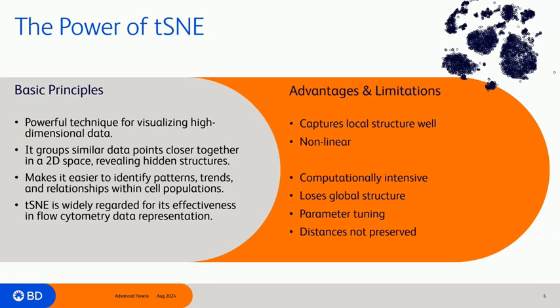However, in FlowJo, we do offer OpenTSNE, and it does aim to simplify those choices for you. So when it's calculating, it attempts to optimize some of those parameters during the calculation process. For instance, it might not go the full number of iterations if it finds that it's not changing significantly between each round of calculation.